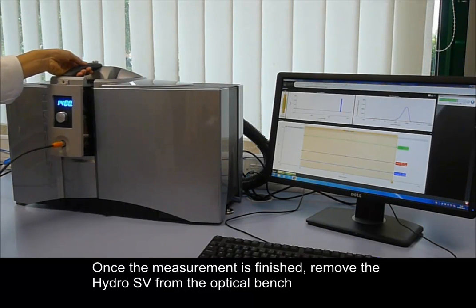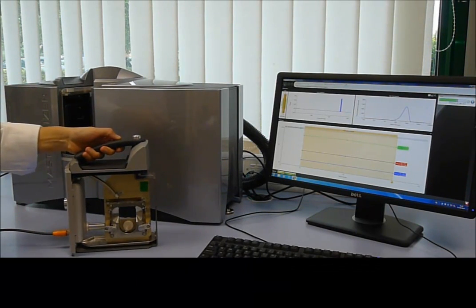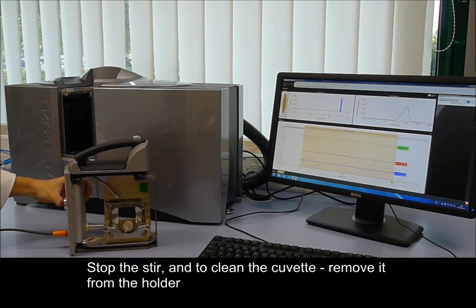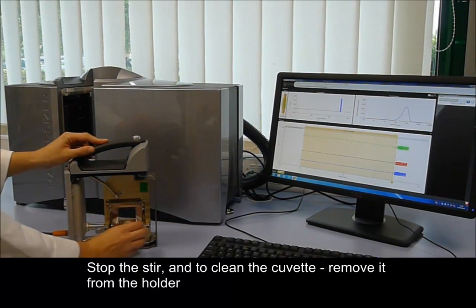Once the measurement is finished, we can remove the Hydro SV from the optical bench, stop the stirrer, and then in order to clean the cuvette, we remove it from the holder.